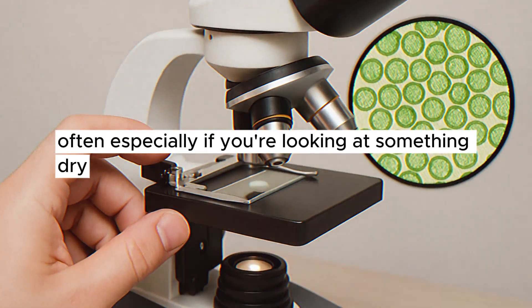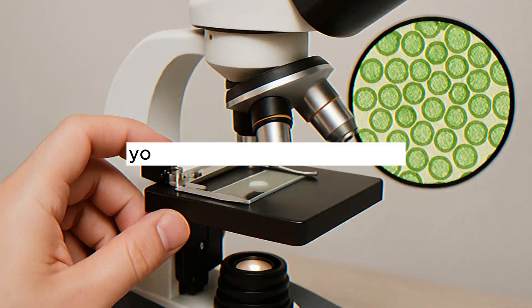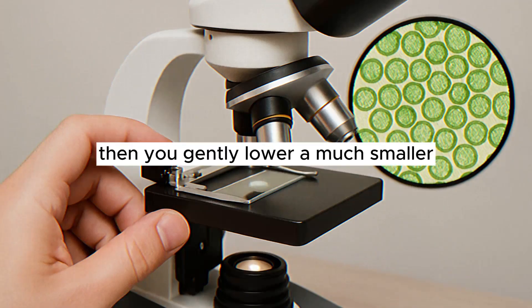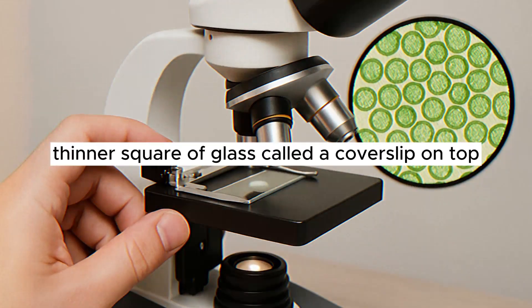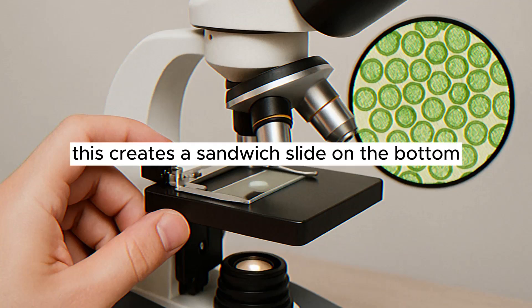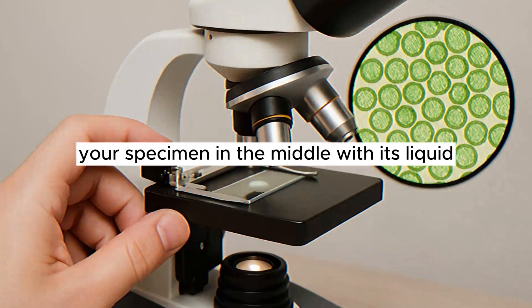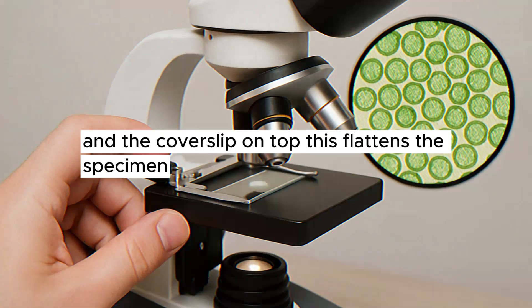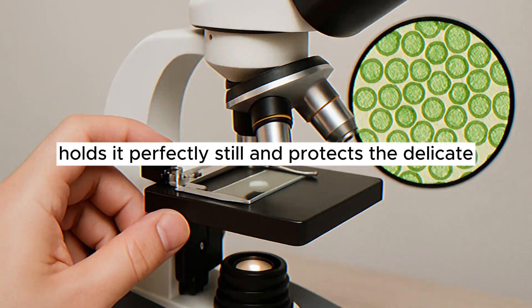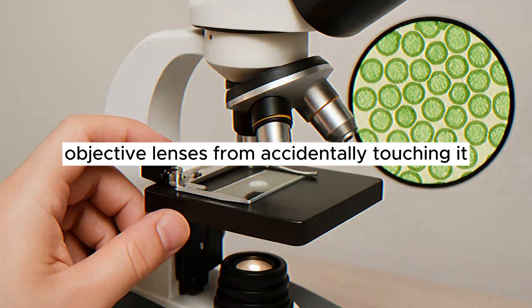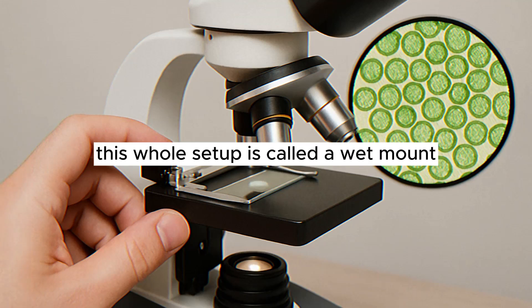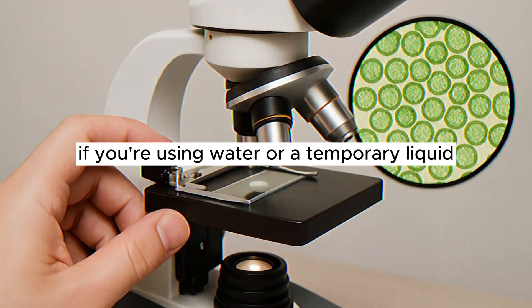You place your tiny piece of specimen onto the center of the slide. Often, especially if you're looking at something dry or something you want to preserve, you add a single drop of water or a special mounting medium onto the specimen first. Then, you gently lower a much smaller, thinner square of glass called a cover slip on top. You lower it at an angle to avoid trapping big air bubbles. This creates a sandwich: slide on the bottom, your specimen in the middle with its liquid, and the cover slip on top. This flattens the specimen, holds it perfectly still, and protects the delicate objective lenses from accidentally touching it. The cover slip also creates an even surface for the light to pass through. This whole setup is called a wet mount if you're using water or a temporary liquid.